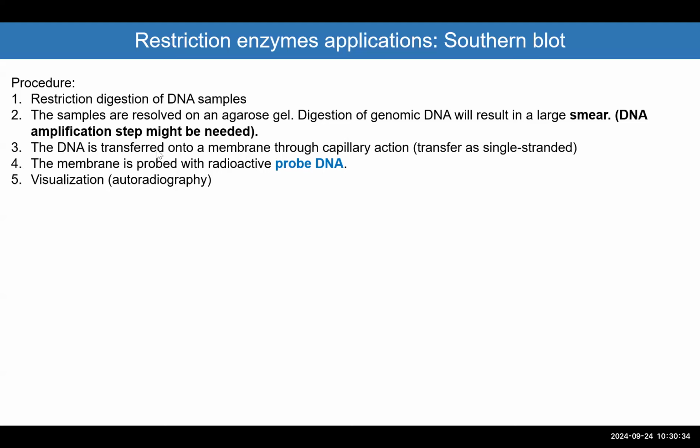Then the DNA is transferred from the gel to the membrane. And after that, we have the probe that is radioactive, and then we can visualize it.